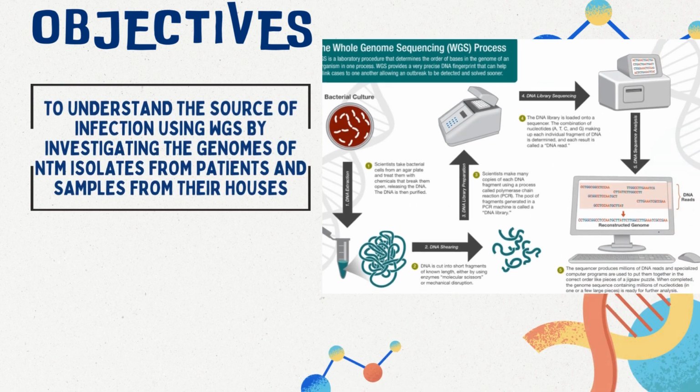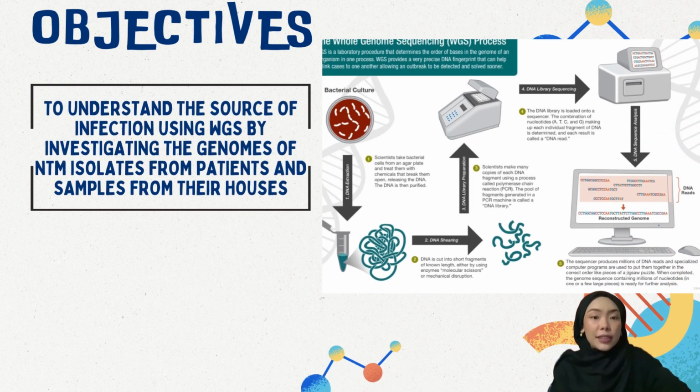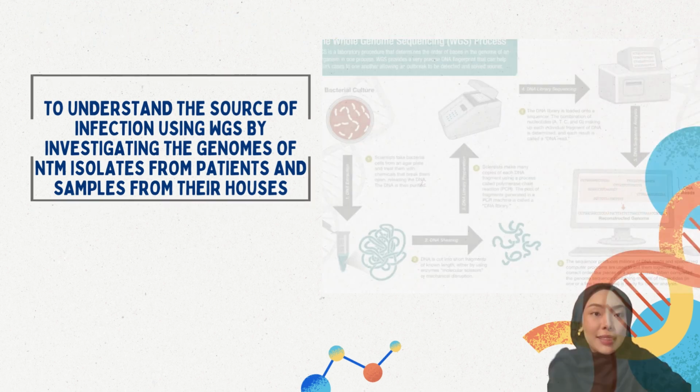The objective of the study is to understand the source of infection using WGS or whole genome sequencing by investigating the genomes of the NTM isolates from patients and also samples from their houses. The picture on the right side shows the whole genome sequencing process.